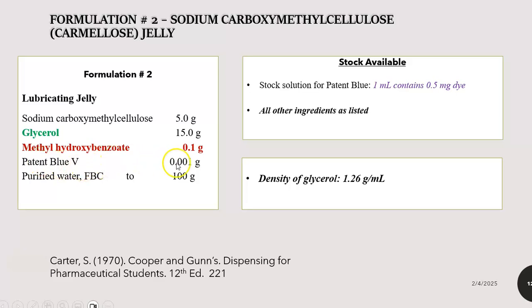The patent blue is given as a stock solution. 1 ml contains 0.5 milligram of dye. That's a nice activity. Calculate the percentage weight in volume for this and see what percent is the solution.